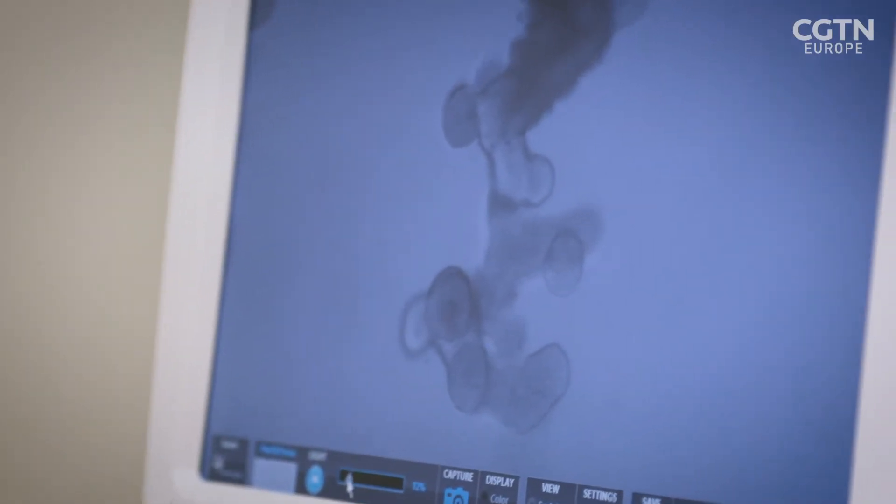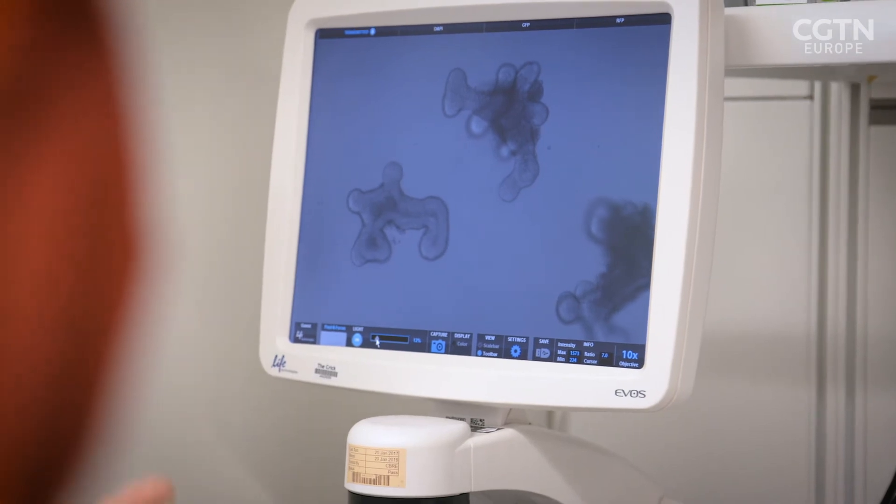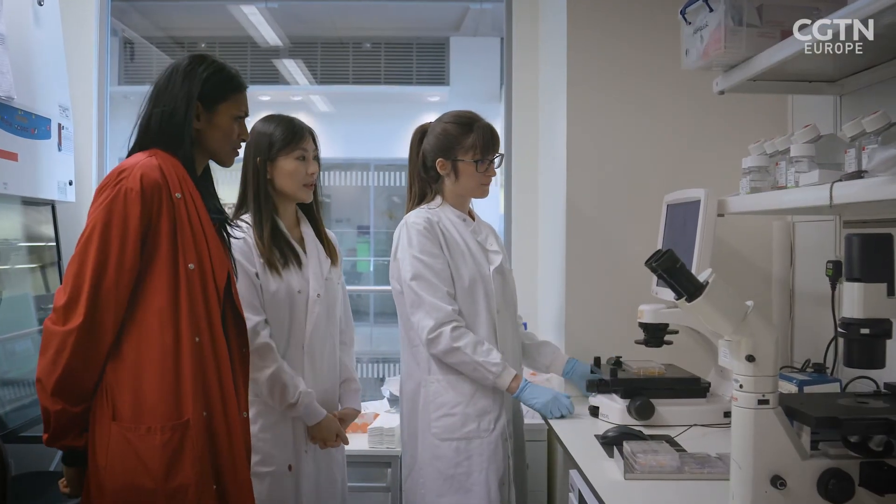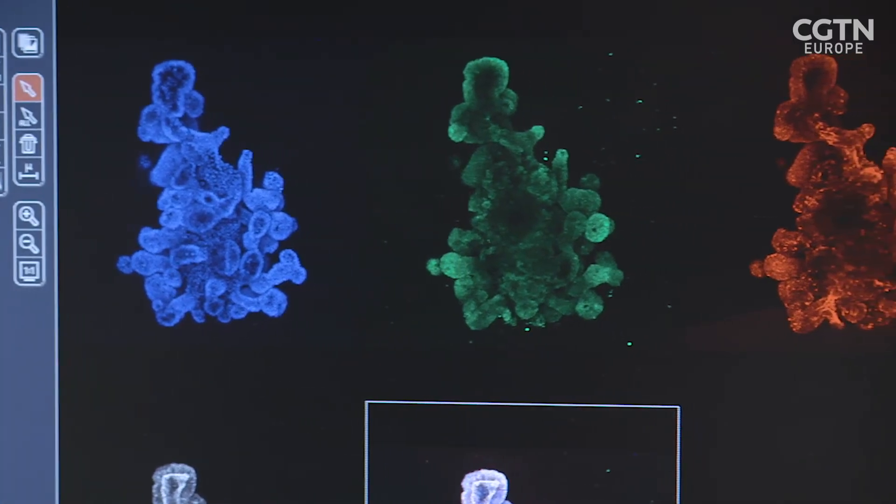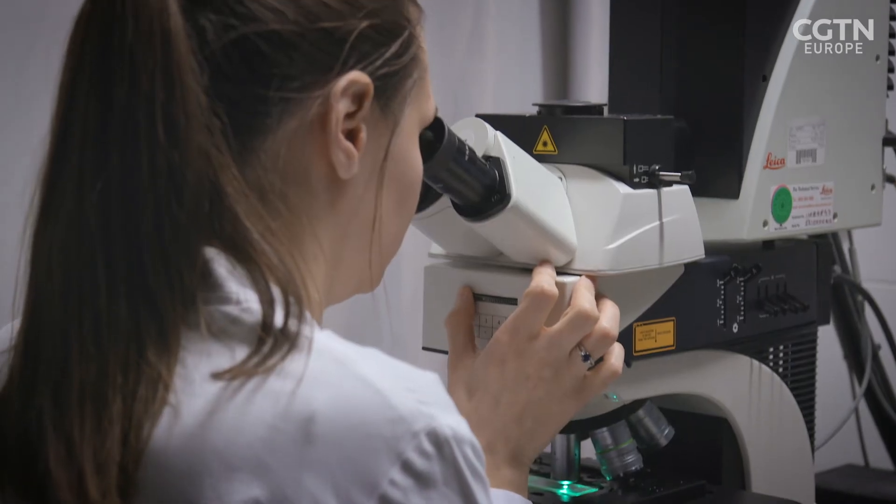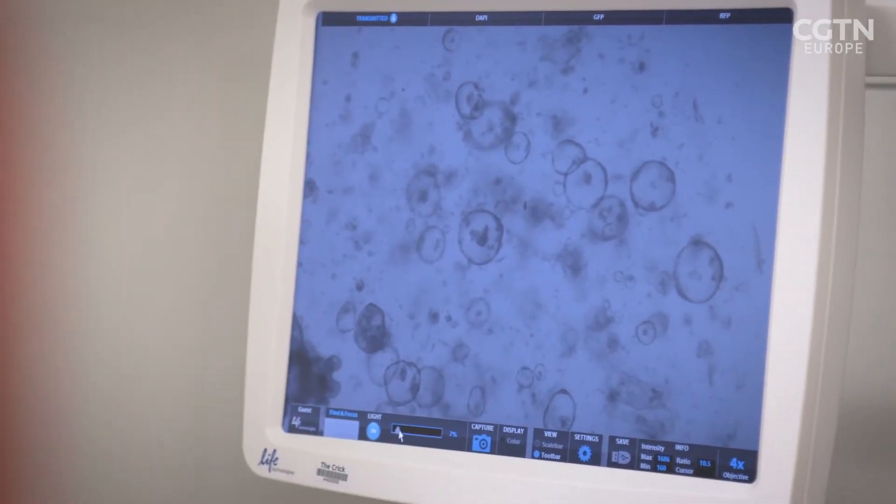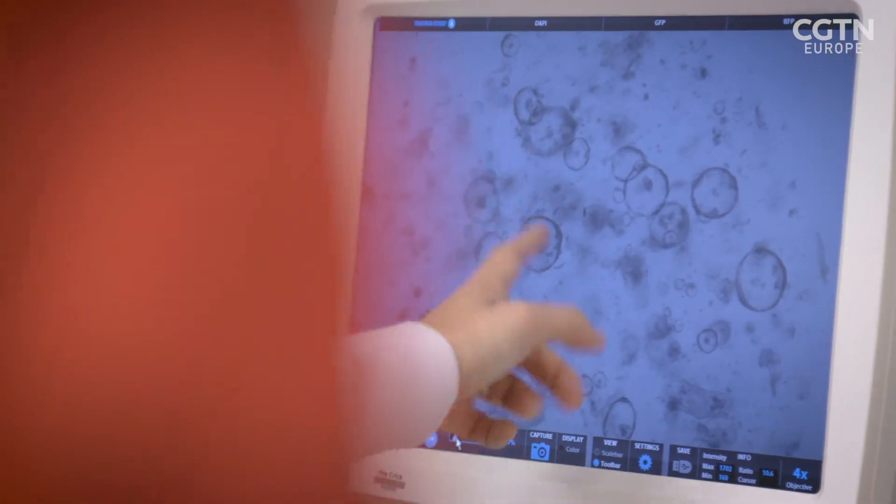Once they've grown into complete mini-organs, cancer-causing mutations can be introduced using gene editing. These disease organoids can then be used to model bowel cancer and predict drug responses. We can show one of the mouse tumor organoids, and they have the activation of the WNT pathway that we study in the lab.